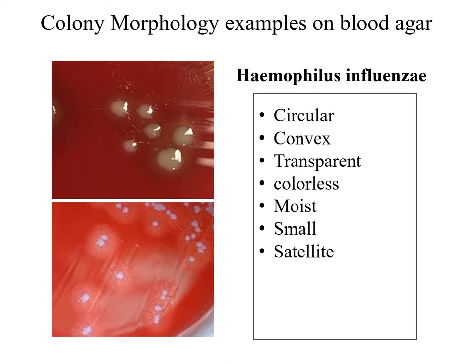This is Haemophilus influenzae. The colony is circular and convex, transparent or colorless, moist, and small. It is characterized by having small pinpoint colonies surrounding it, which we call satellites.